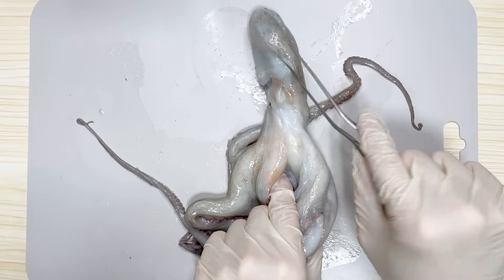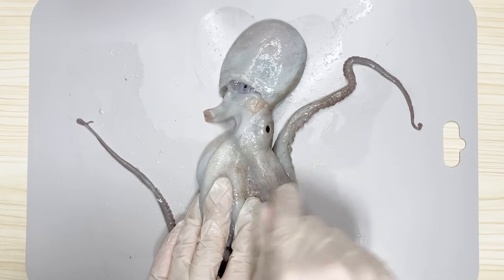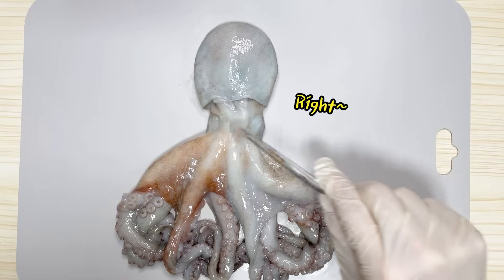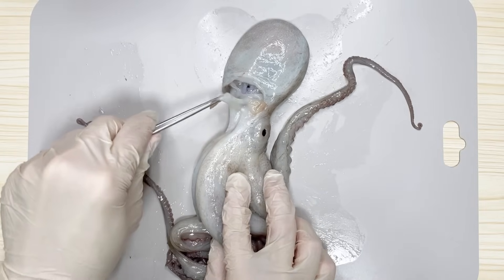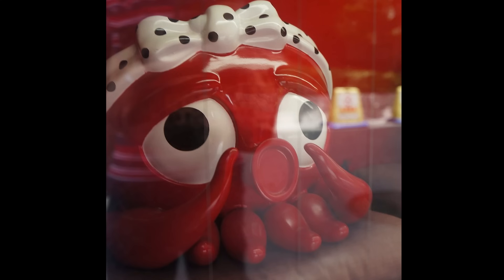Their ability to move quickly is facilitated by the siphon. Octopuses fill their bodies with water and propel themselves by expelling water through the siphon while swimming. The siphon also allows for directional changes. Although the siphon can be mistaken for the mouth, it is located towards the back of the head, even above the eyes. Since the siphon is used for expelling waste and water, it is more comparable to the anus than the mouth.